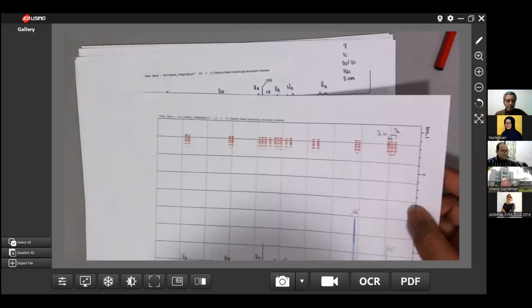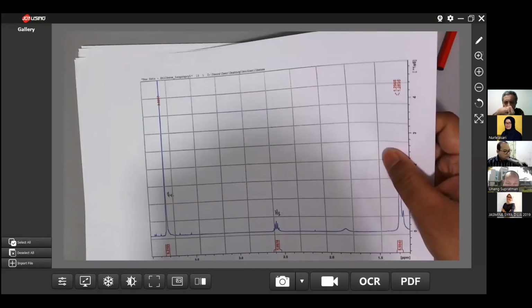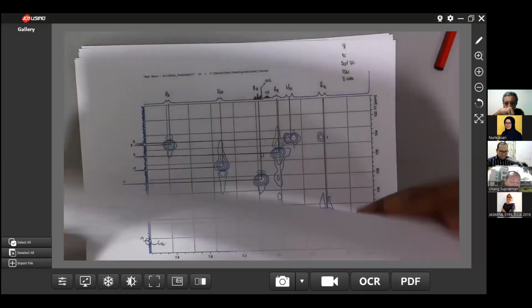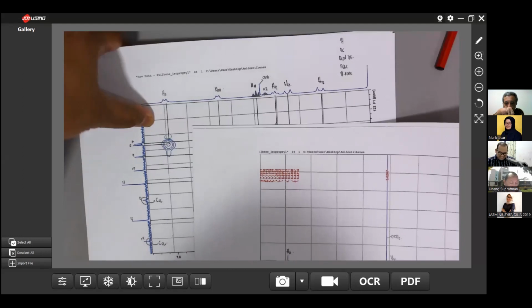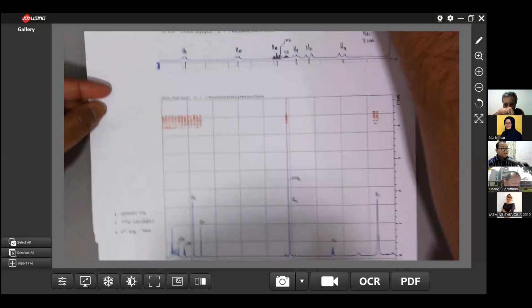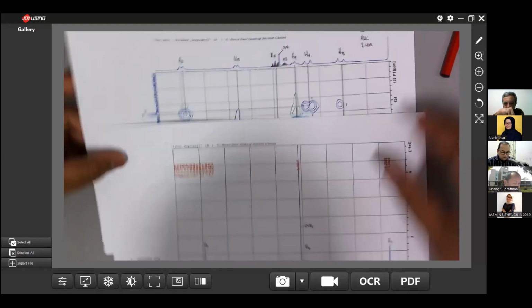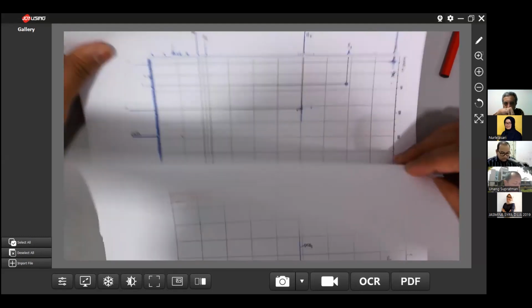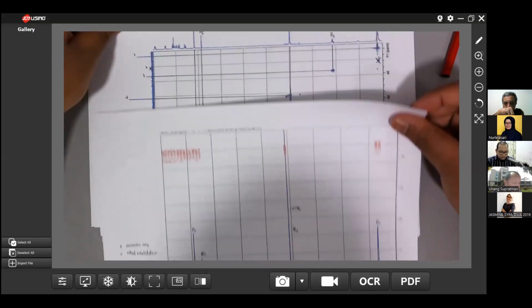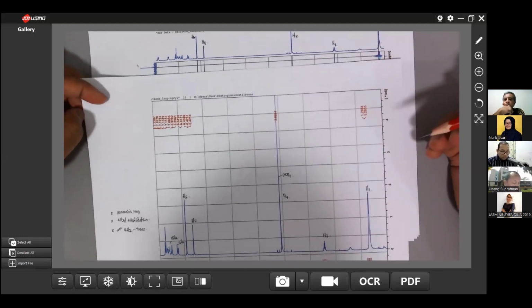So again, open your proton, students. Yeah, quite messy here. I'm sorry, this is how we read the NMR. I hope you can see here. For the first arrangements of the COSY, this is the COSY one. You can start to label and transfer all information from the HSQC to the protons.